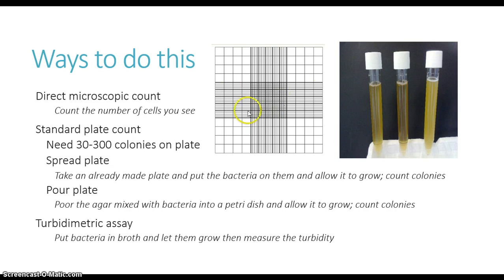I actually do this. I work at the vet school, and we do this exact thing, so it's kind of dear to me. But so it is a thing. We're not lying to you when we say that this is a direct microscopic count. We do this with parasite eggs, and it works very effectively.